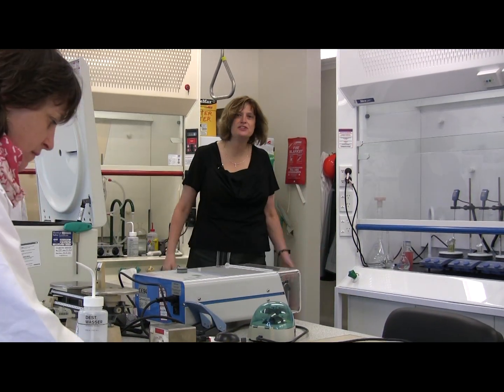This is the sample preparation laboratory for radiocarbon dating, and today we're going to show you a little bit about how radiocarbon dating is done. So how does radiocarbon dating work?